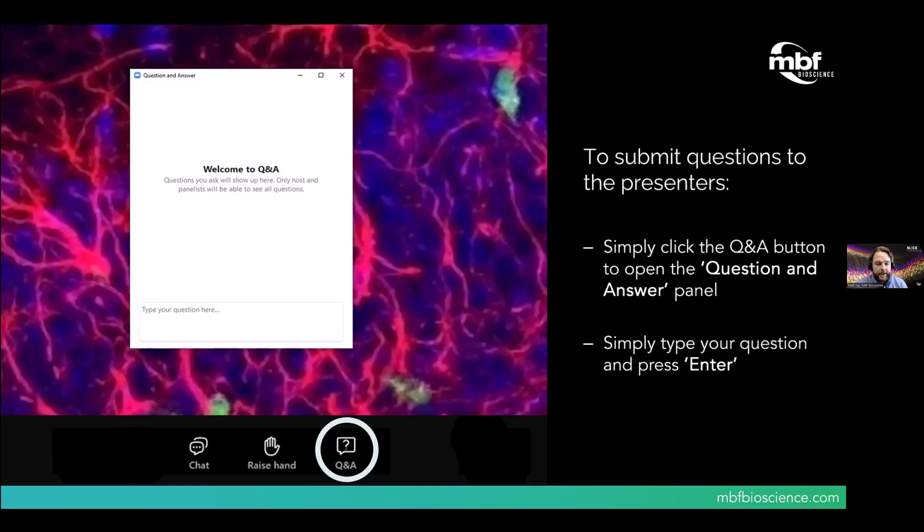Our standard size is a 1 centimeter square cuvette by about 42 millimeters, which typically fits most mouse brains unless there's a little bit of expansion going on. We have a 10 by 5 millimeter cuvette, as well as a 10 by 20 and a 20 by 20 cuvette available.